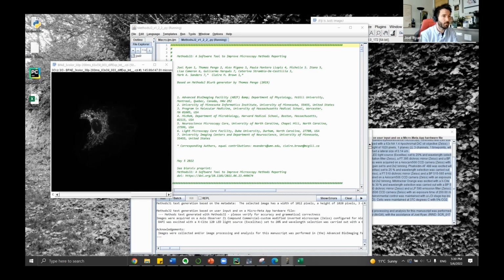Again, leveraging Bio-Formats to go get the information from the CZI file, and I guess have a function that, if it detects it, it puts it in. If not, it has a string field and reminds you to add it. But yeah. And then, any other questions on MethodsJ2?